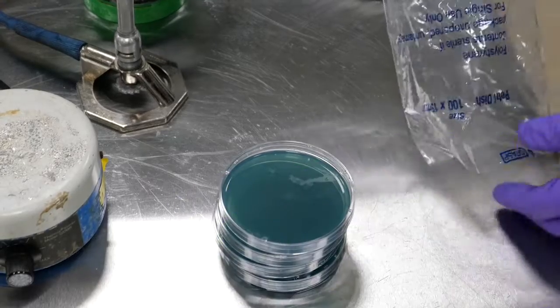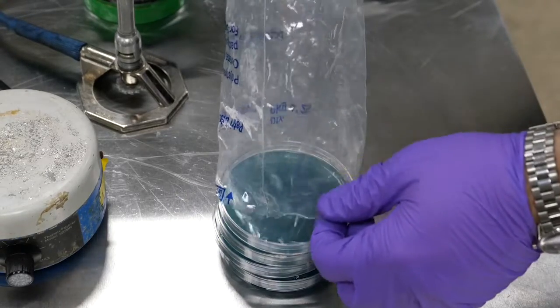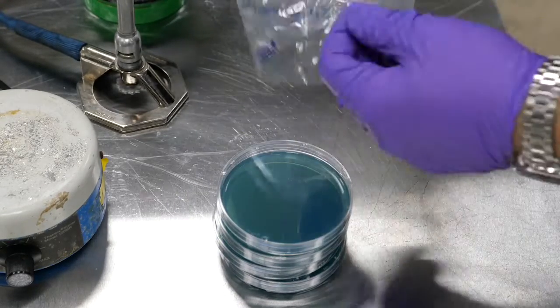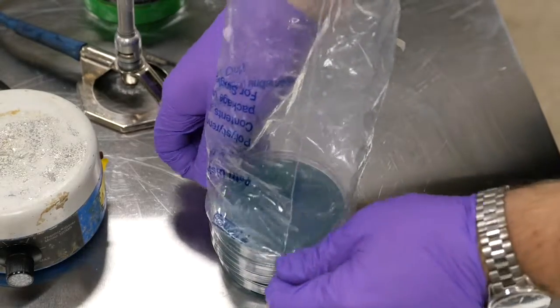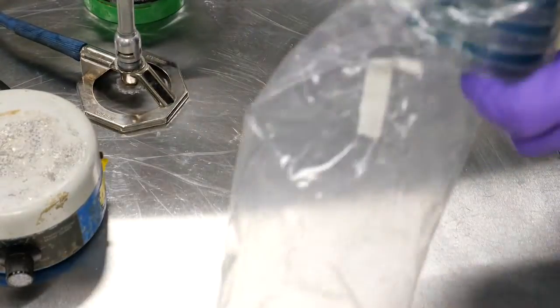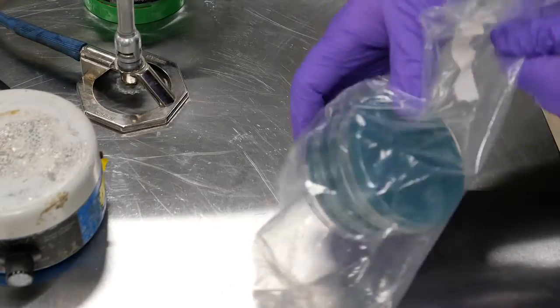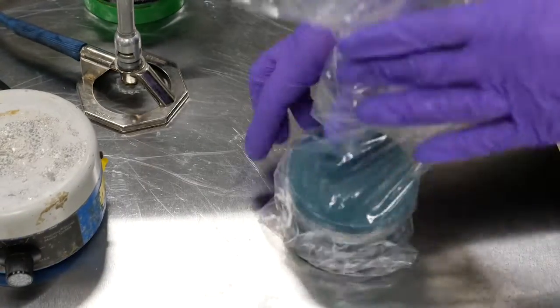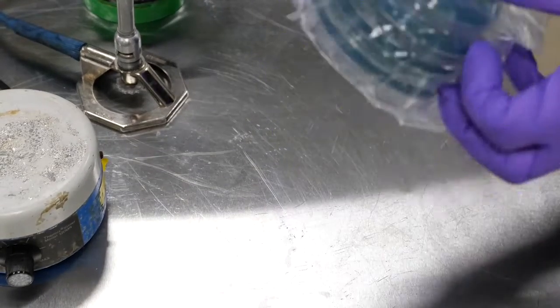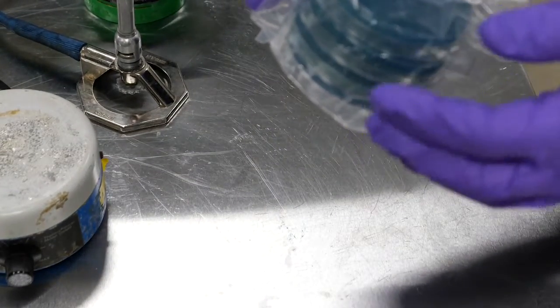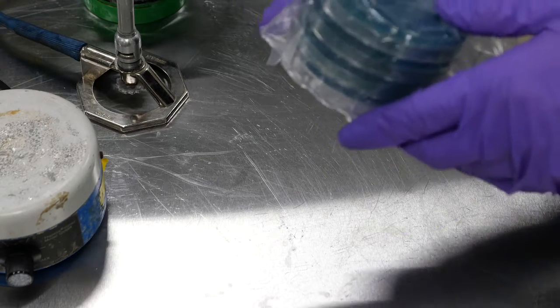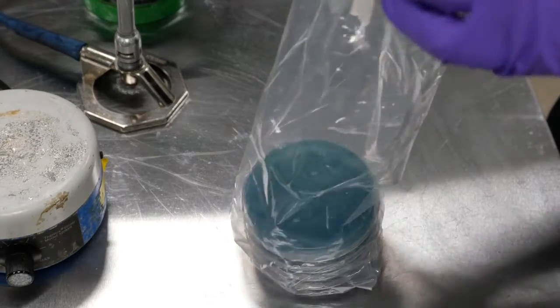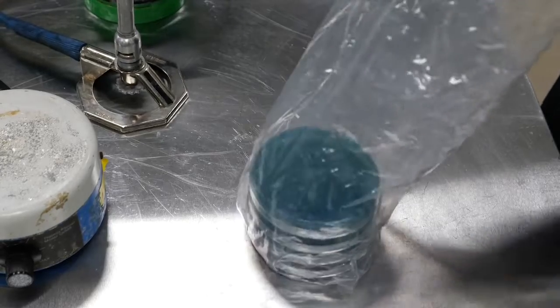And then to put them away, usually what I'll do is flip them over, put them back in that sleeve. And then when we store them, we want to store them facing with the agar side up, agar side down rather, so that any condensation doesn't get on the surface of that agar.